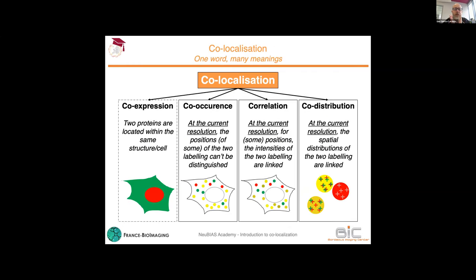But the problem, and this is one I come across quite a lot working in a facility, is that co-localization encompasses quite a lot of different topics. In fact, co-localization is a big word that covers several typical experimental situations.